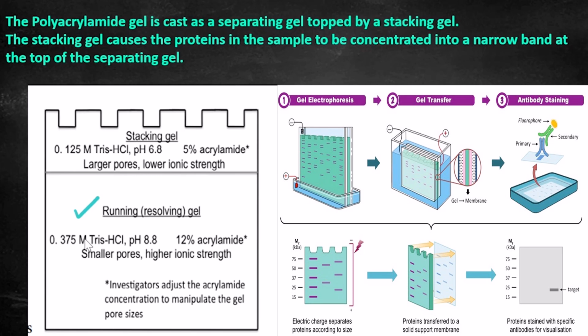Another step is making of gel. How to make gel and how do the gels form? What are the major components of gels?